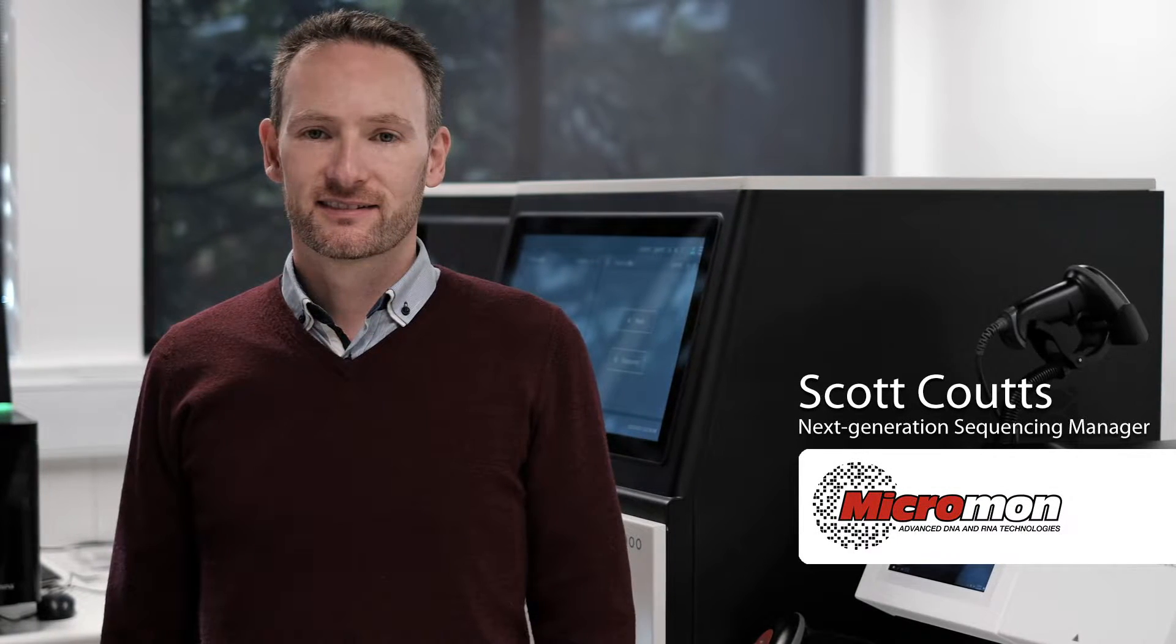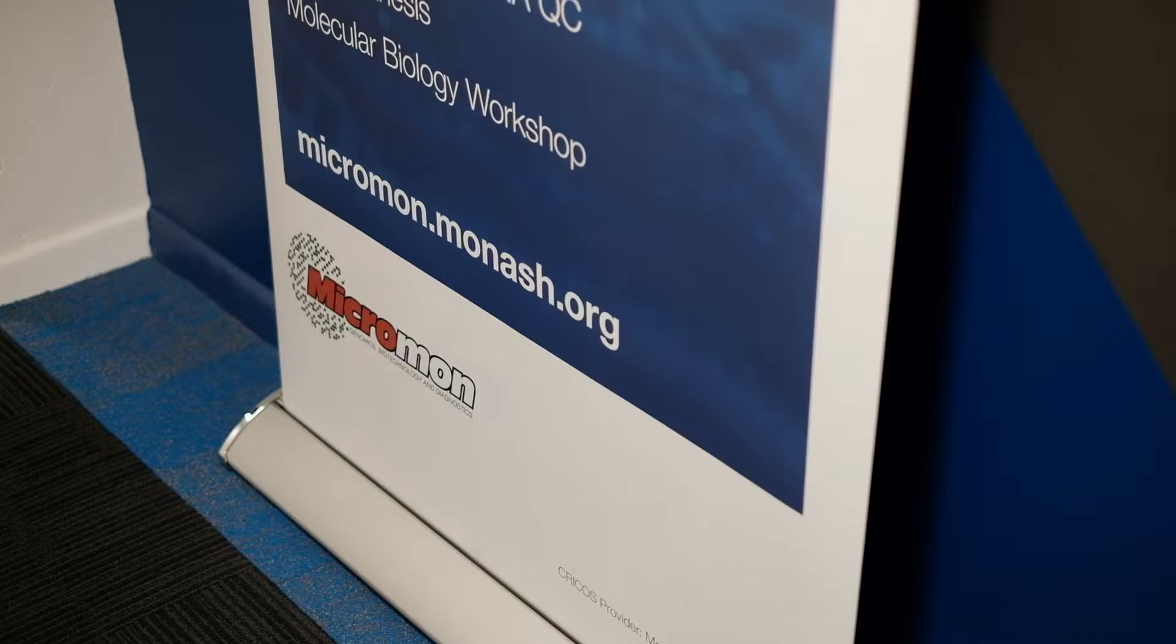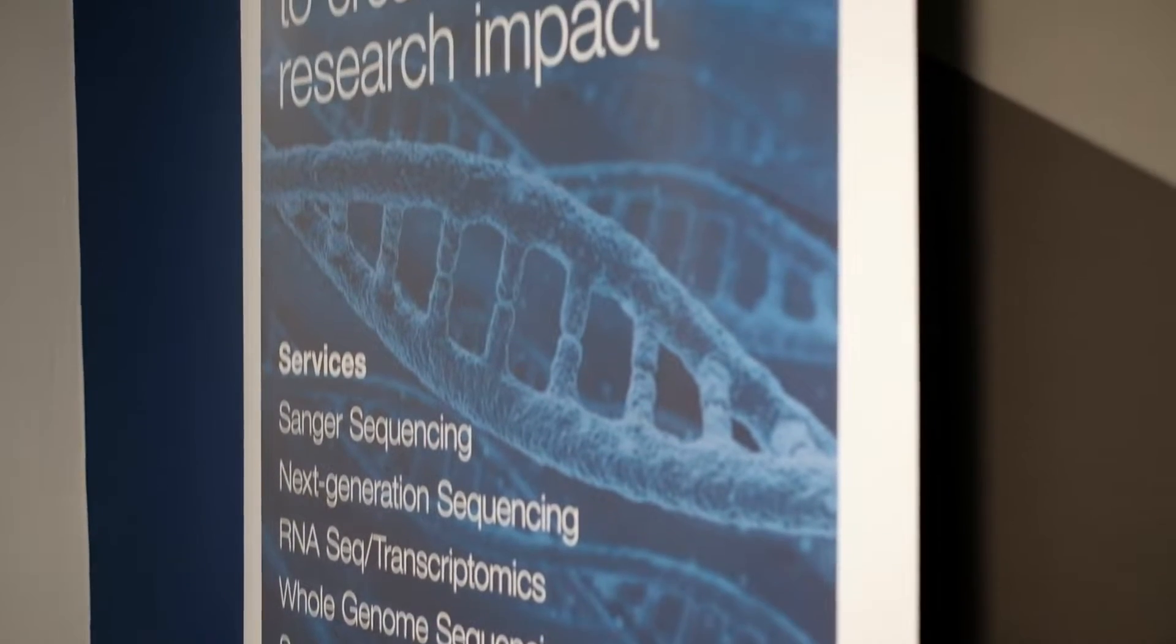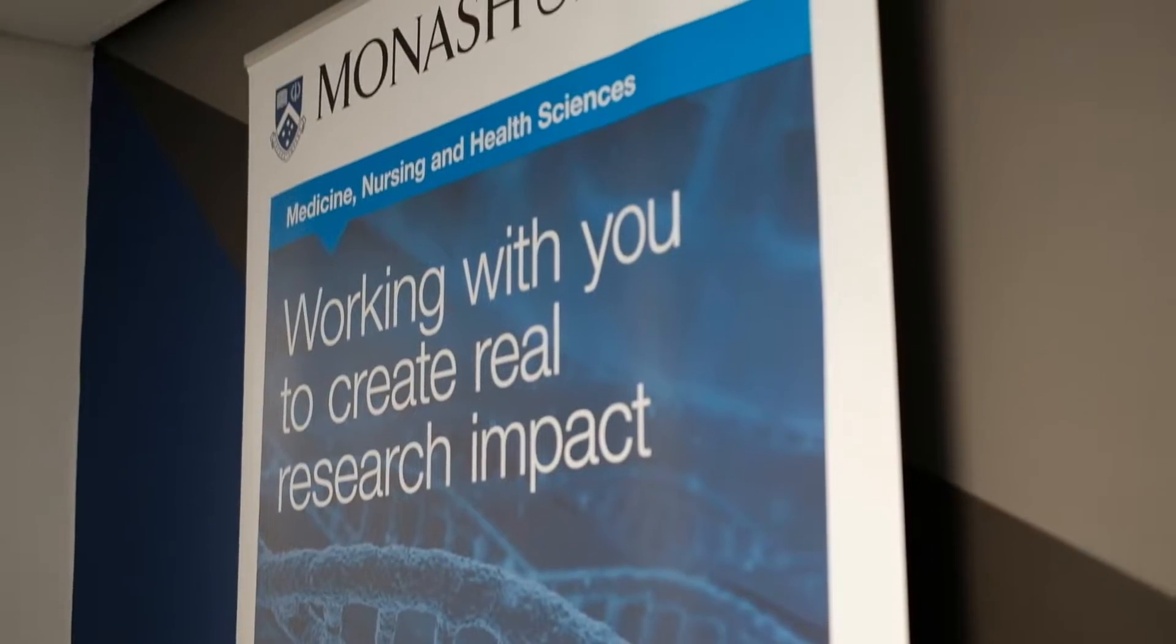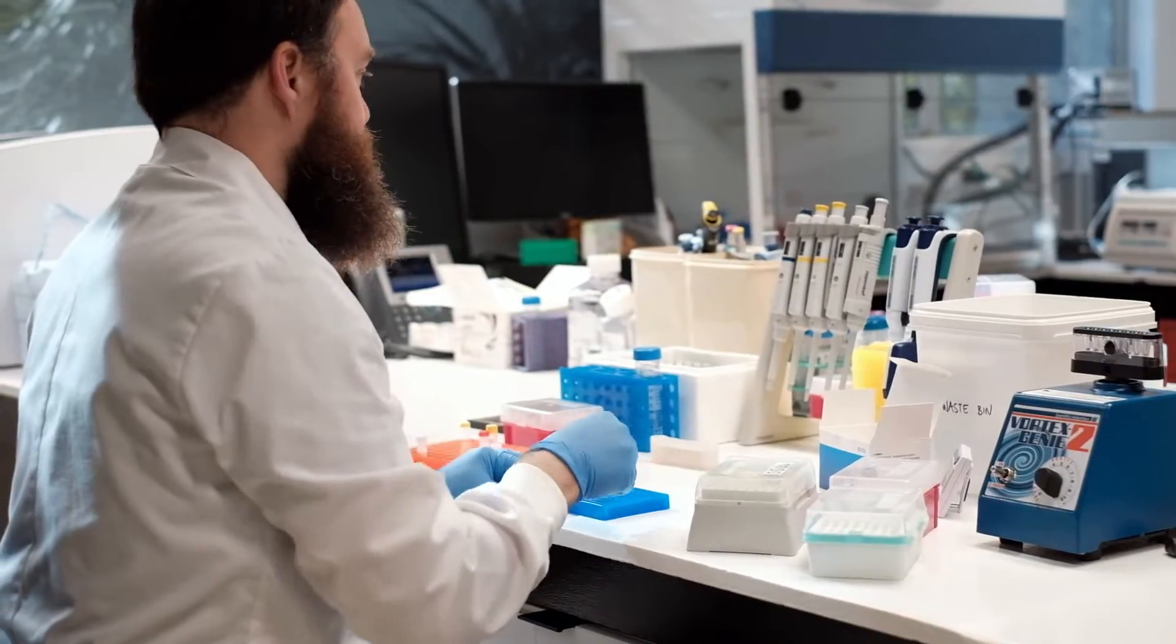So Micromon is a generalist DNA and RNA technology service provider, a core facility at Monash University. So we provide DNA and RNA sequencing and analysis services to the scientific community as a whole.